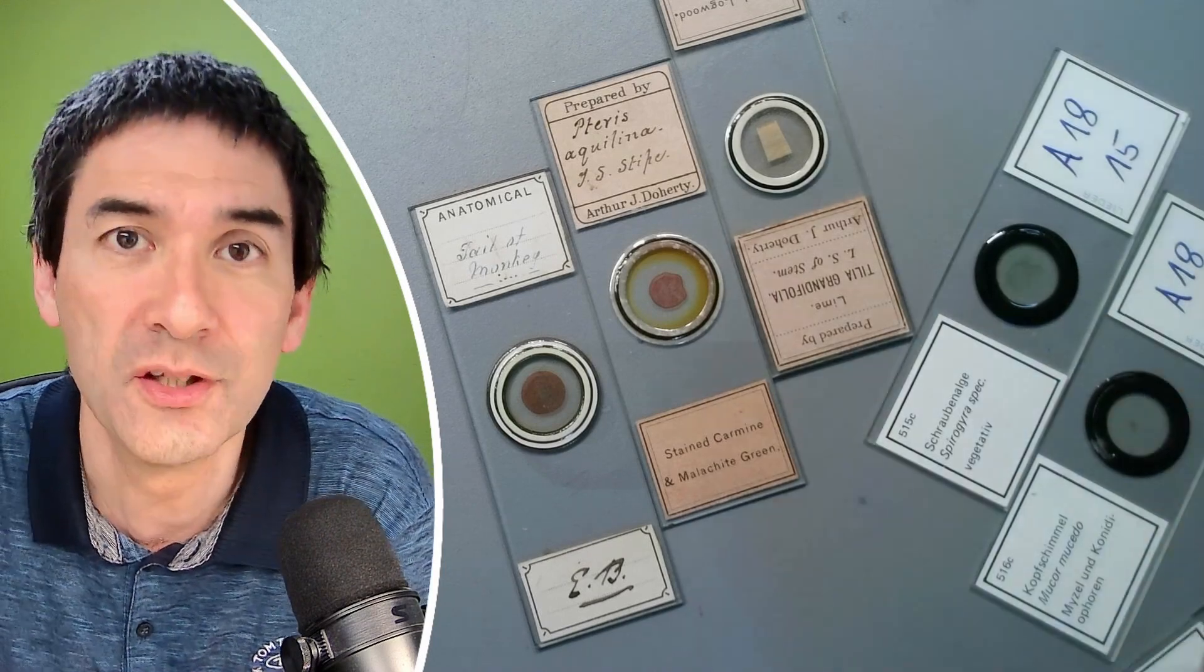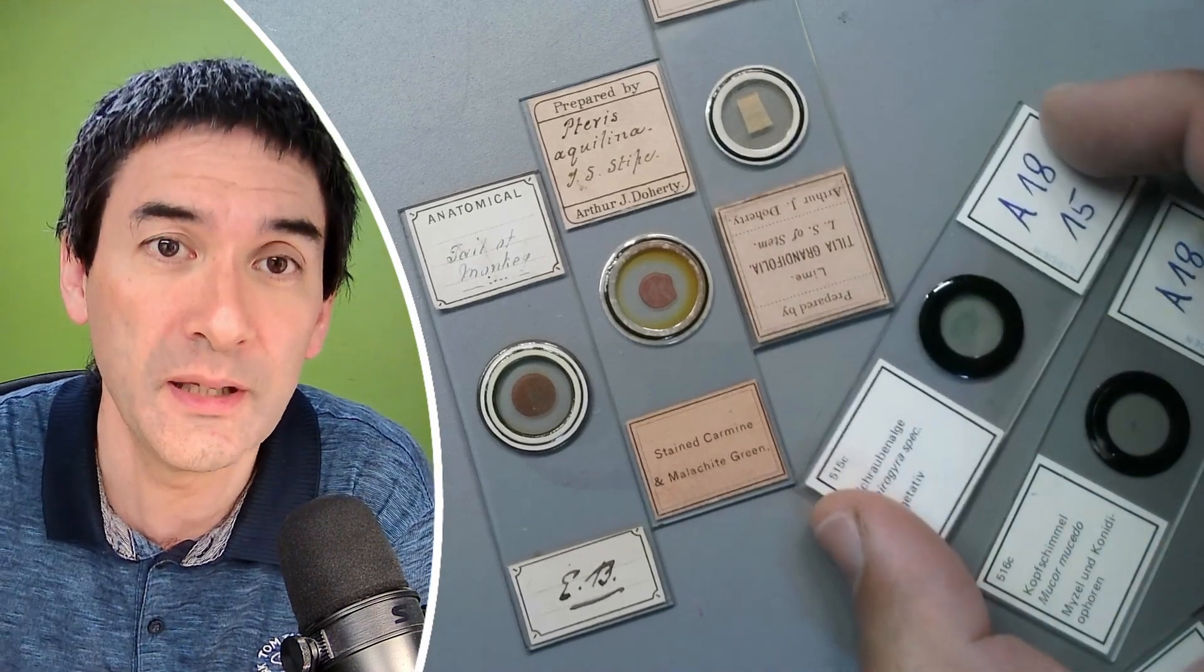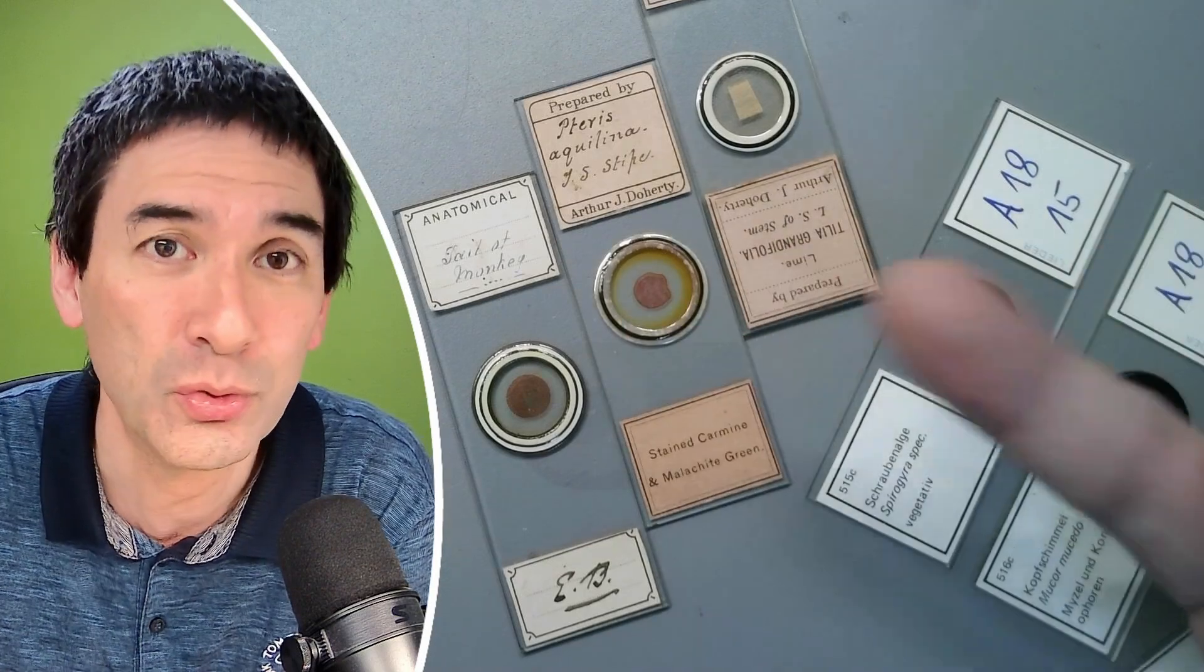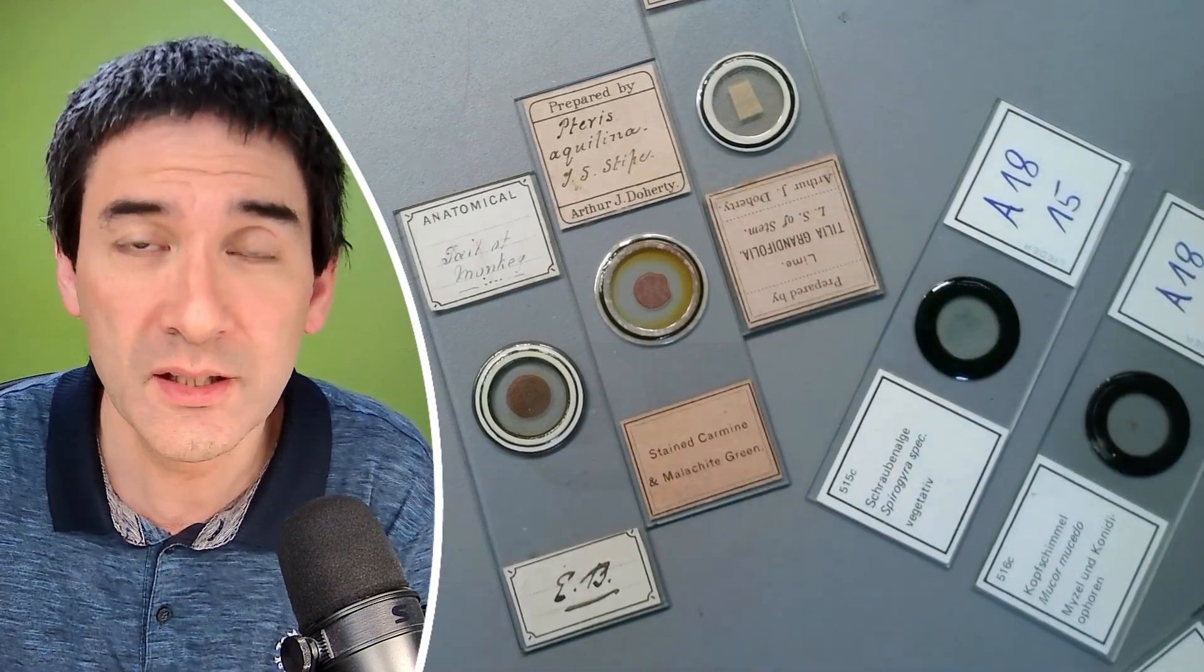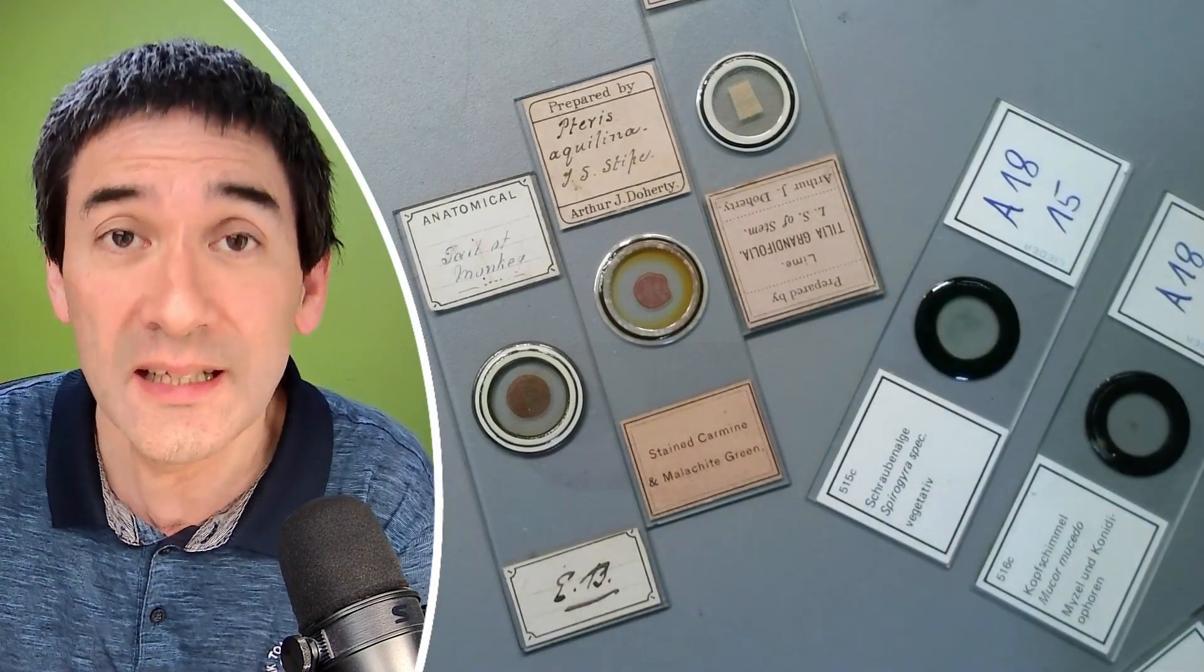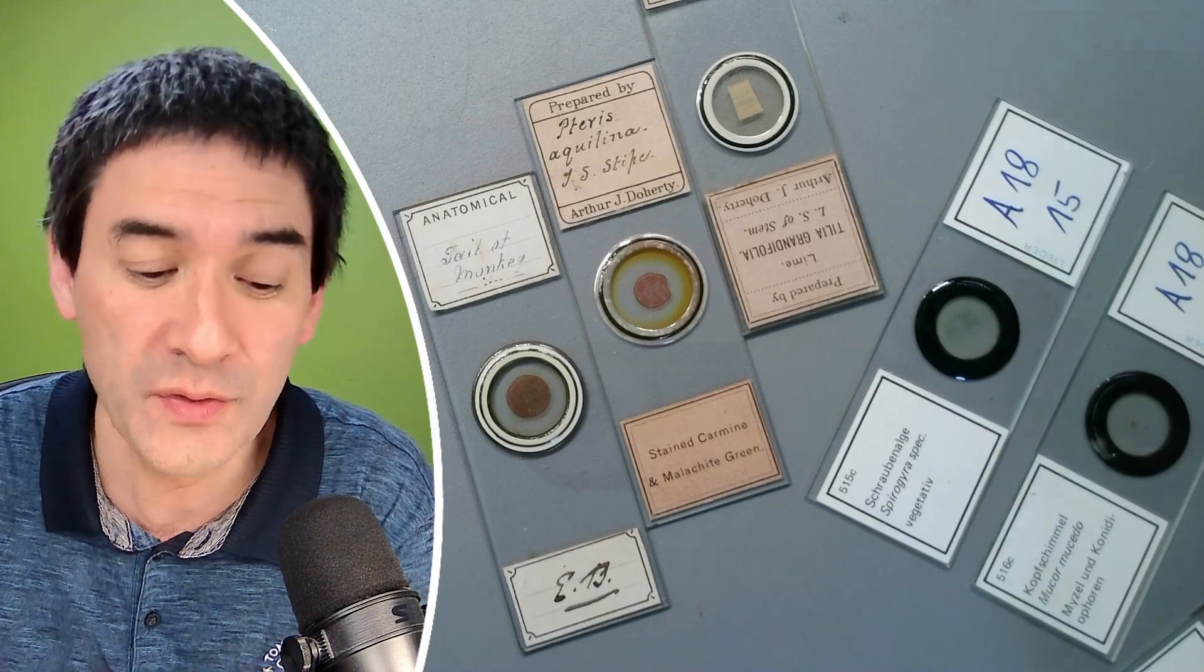Also, the opposite is of course true that when you place the slide in a very humid environment and moisture is able to go in, you want to prevent that. So that is another reason. And then, of course, another reason is a physical one.